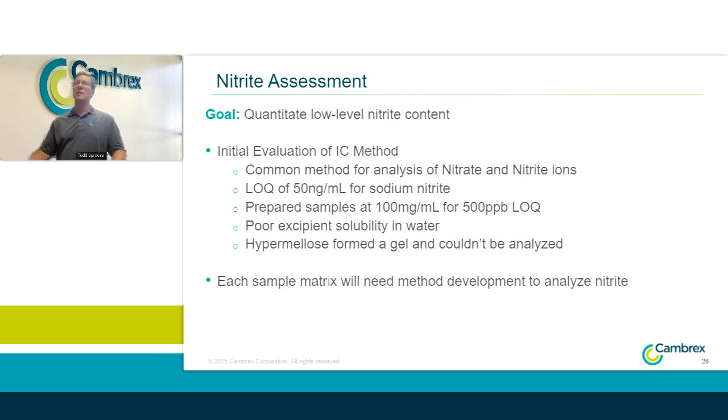So again, from the analytical perspective, nitrite being that key component in the nitrosamine formation, we've evaluated ways to quantitate low-level nitrite content, which creates a bit more of a problem, as nitrite, we will find, is everywhere. Initially, we started using ion chromatography, which is a common method for nitrite and nitrate ions, and found an LOQ of 50 nanograms per mL for sodium nitrite. We were able to prepare samples at 100 mg per mL for extraction for a 500 ppb LOQ.